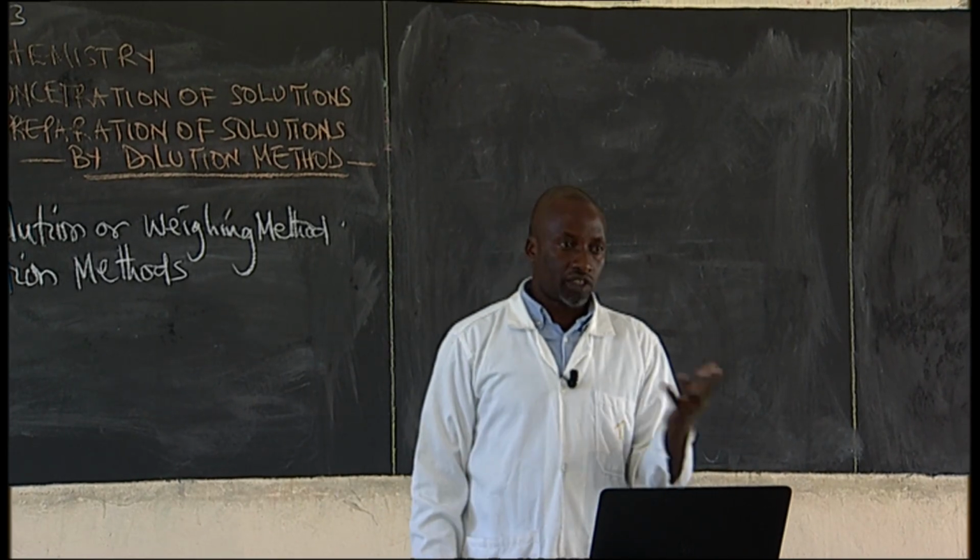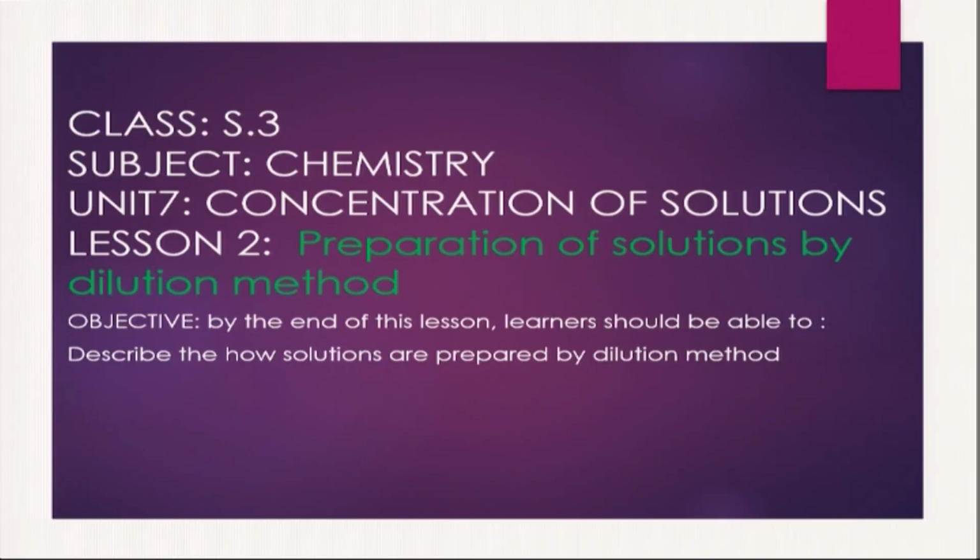By the end of this lesson, please, dear students, I expect you to describe how solutions are prepared using the dilution method. How can you prepare solutions of specific concentration by using dilution method?